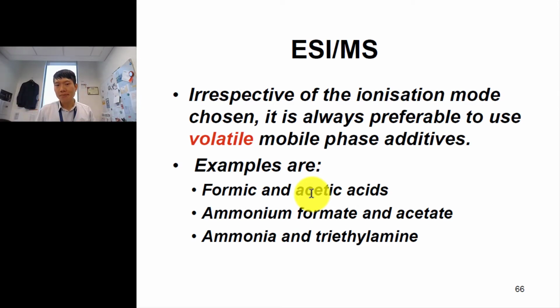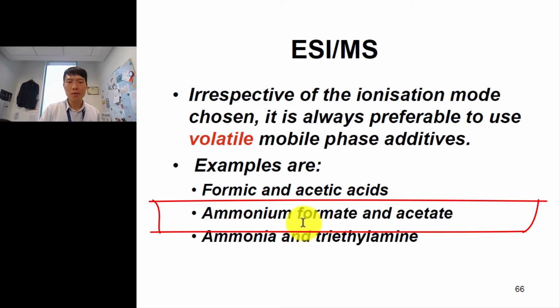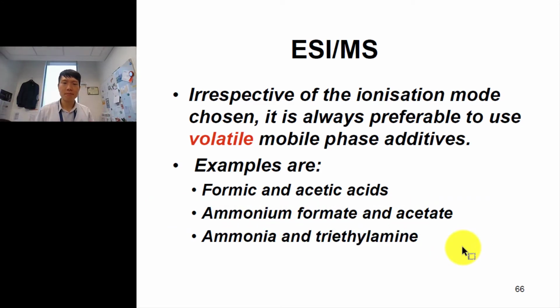For the basic side, we can use ammonia or triethylamine. For something in the middle, we can have ammonium formate or ammonium acetate, more like a buffer, a weak base plus a weak acid together.